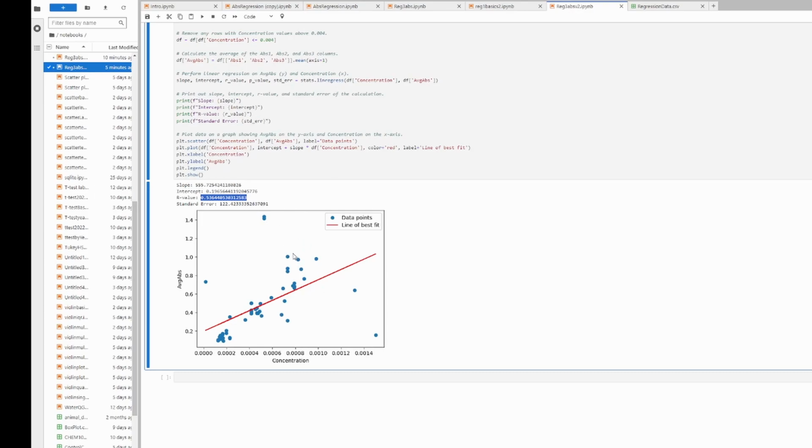We might want to get rid of anything above 1.1, and that would remove these data points and these data points, and we'll see that the fit will get better. We do need a reason to get rid of these. We can't just sort of say that they're off. But it turns out that in the instrumentation that we use, there's no values that we can get essentially really above 1. We've got it designed so that none of the instruments, none of the concentrations will be above 1.